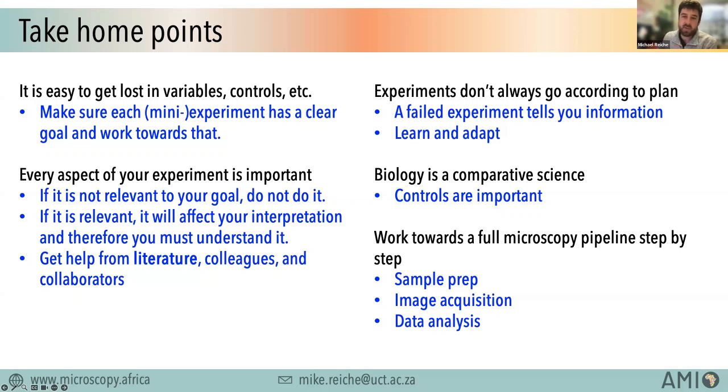So it is a bit dependent on the biology, but let some of the literature guide you. If other papers have got very good information and you think that they have strong statistics, work from that. If they did 30 different histological samples, let that be a starting point. It's also about balancing your technical repeats from your biological repeats in order to ensure your confidence in your result. So I apologize, it's not a very satisfactory answer, but it is a very context-specific question.